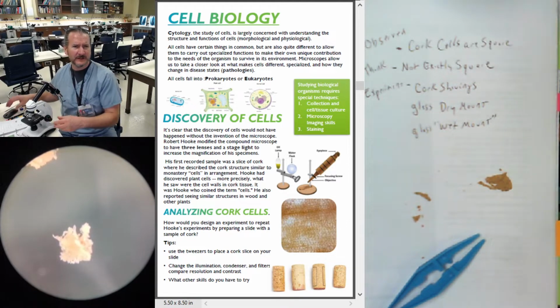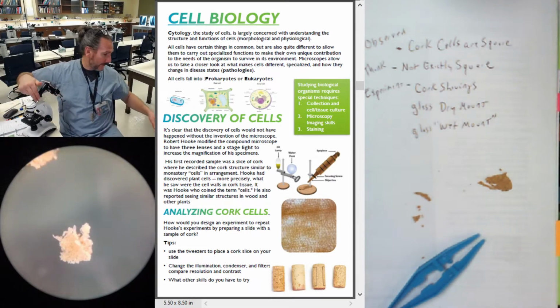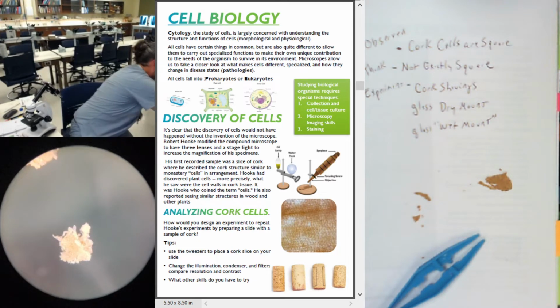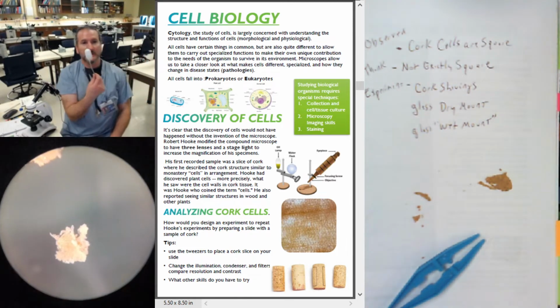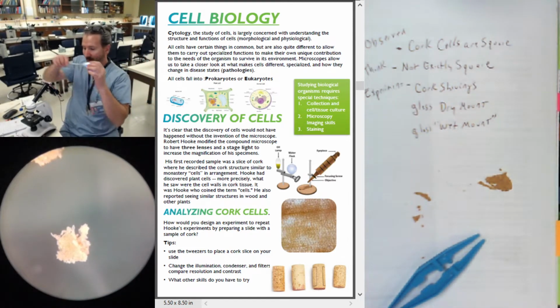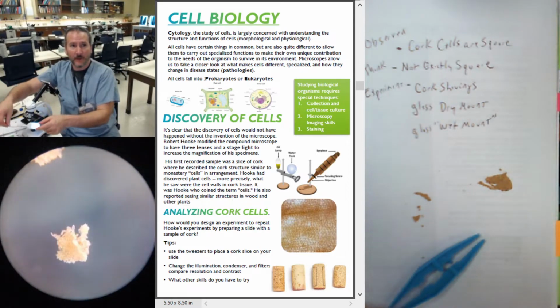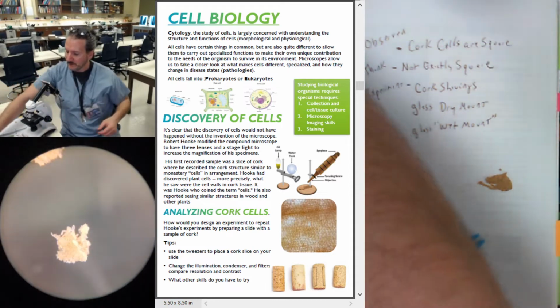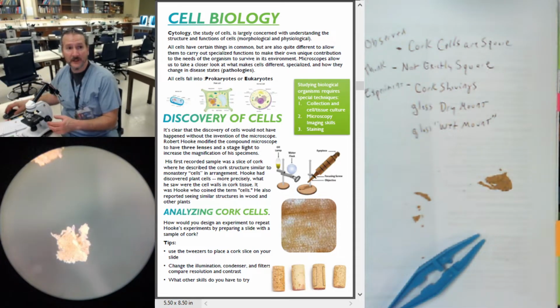You know, you can do this too. If the light on your microscope's not perfect, you can always grab a second light, kind of like this one I bought at the dollar store, and you can add your own lights like I did, coming at whatever perspective you need it to. So you can control your shadows from any perspective. Right, so that's pretty nice.